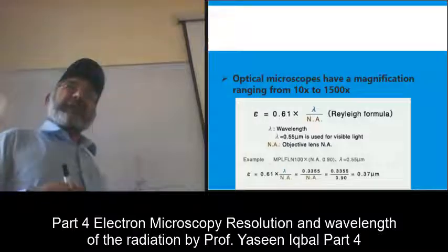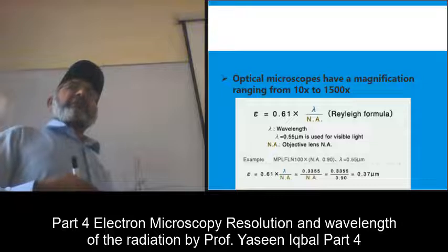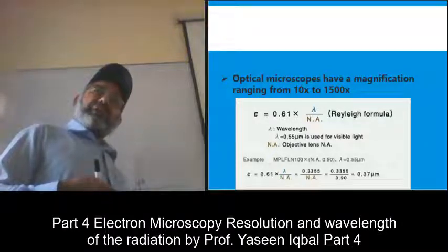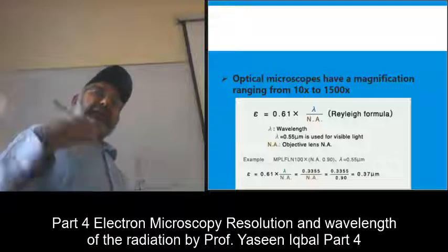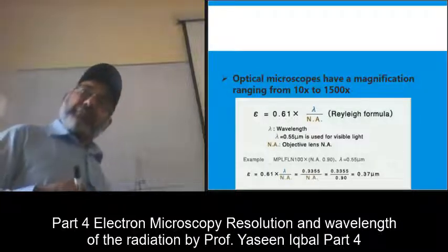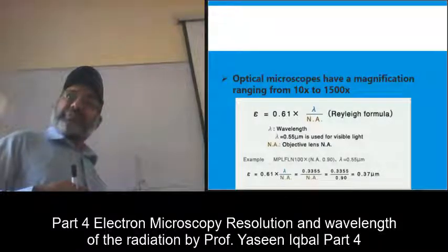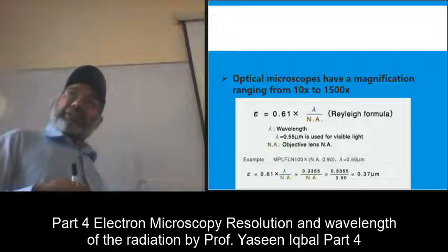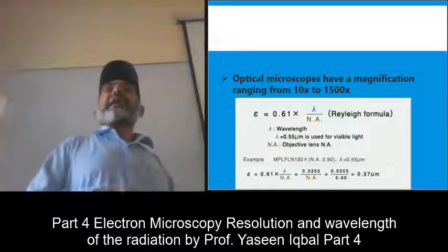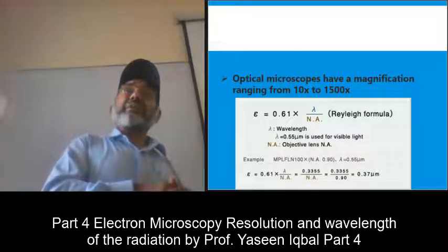The interplanar spacings which are struck by the X-rays or electron beams or other diffracting radiations, the information from there comes exactly 3.37, but it is the electronics which transforms the material into that output. It is not the same.